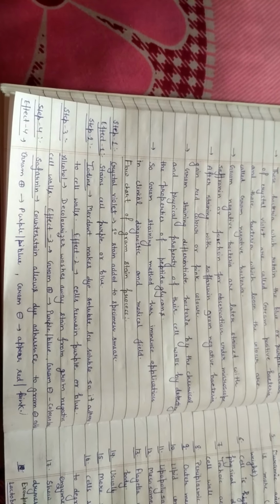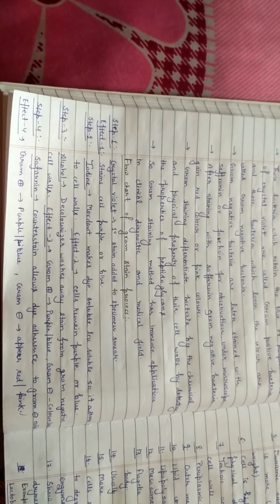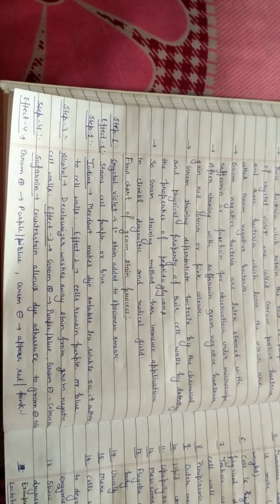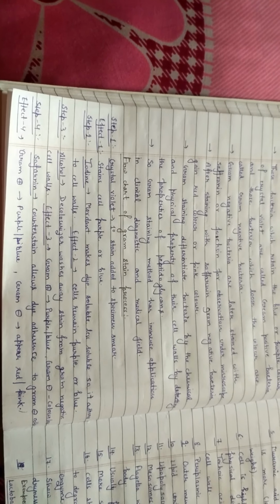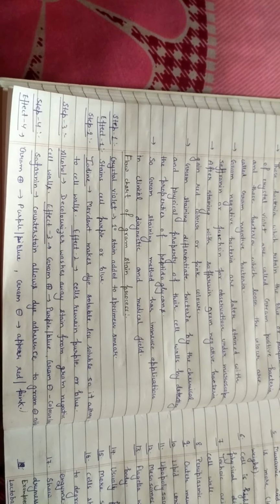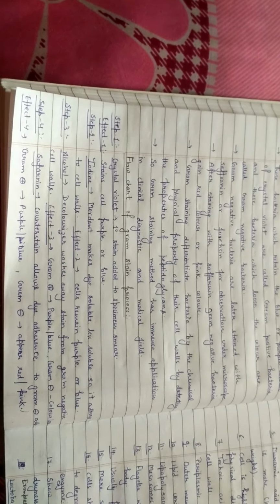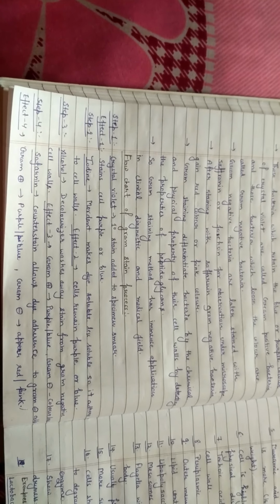The next step is treatment with alcohol, which acts as a decolorizer or destaining solution. It washes away the purplish or bluish color in gram-negative bacteria, because gram-negative bacteria have more lipid content, and alcohol dissolves lipid.